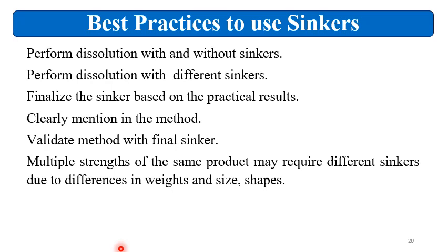Then multiple strengths of the same product may require different sinkers, because the different strengths have different weights, sizes and shapes. So the same sinker should not be used for the different strengths of the same formulation. Always have a separate sinker evaluation for different strengths.